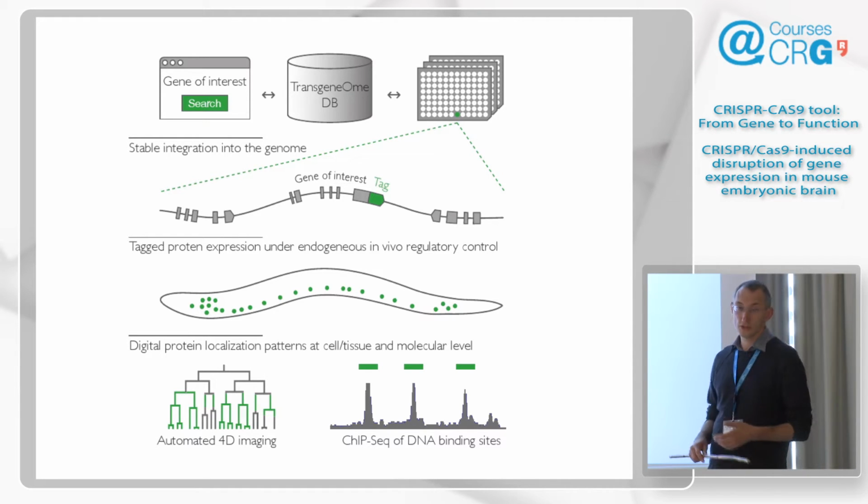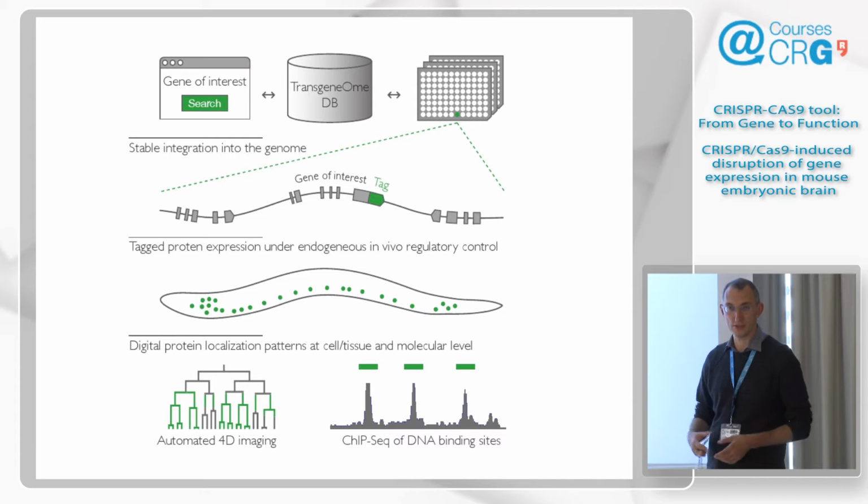Importantly, it was also possible to engineer them efficiently through recombination, which you've heard about this morning. I'm not going to go into details of recombination, just to say that we've developed methods to apply recombination in a multi-well plate. One plate is 96 wells, but we can process many plates in parallel, so we can do thousands of proteins.